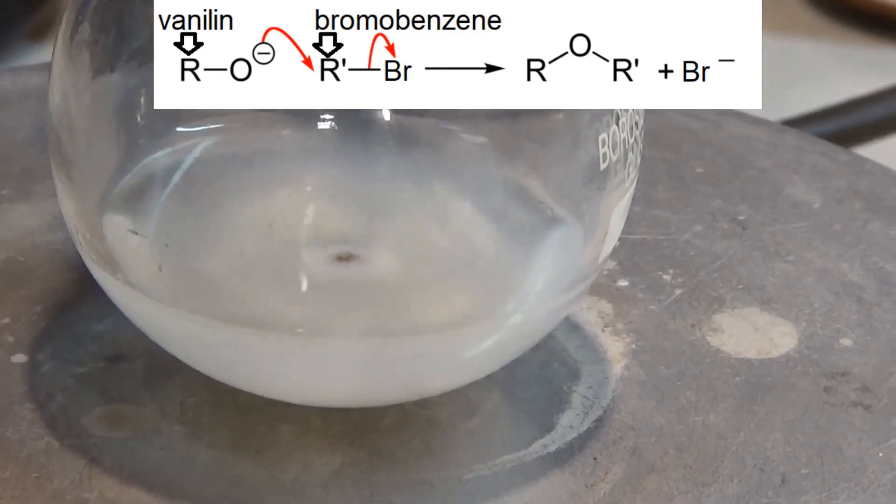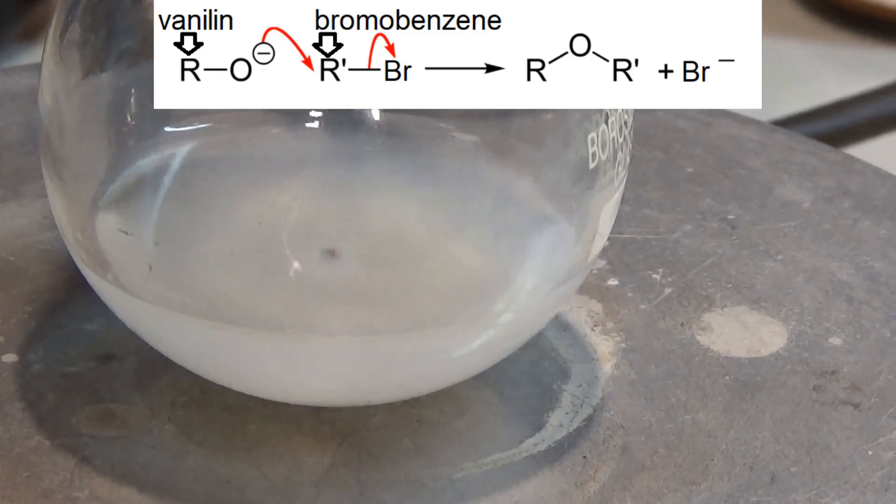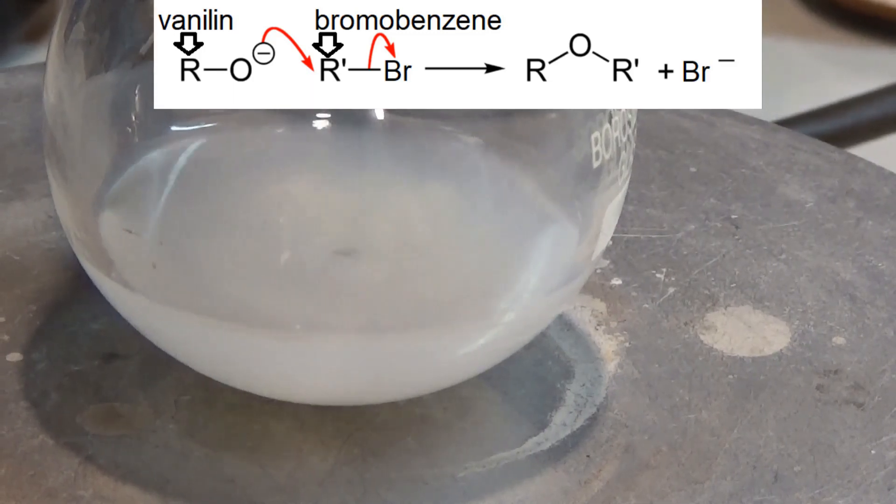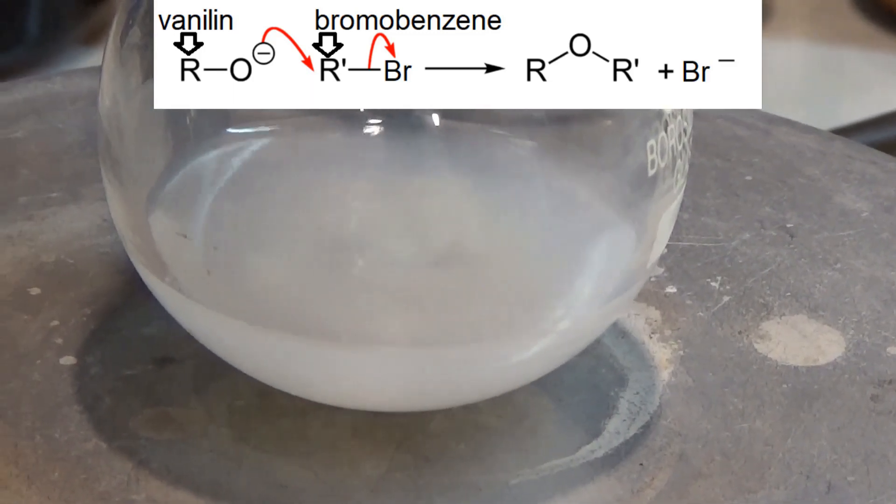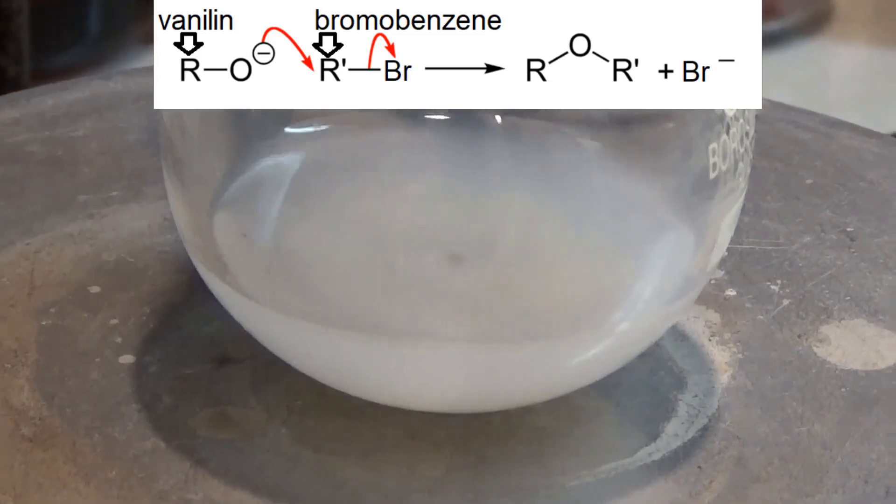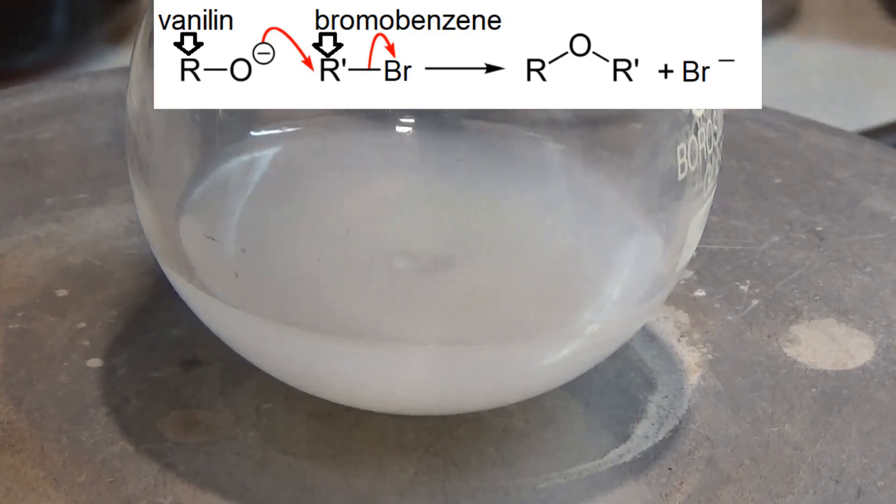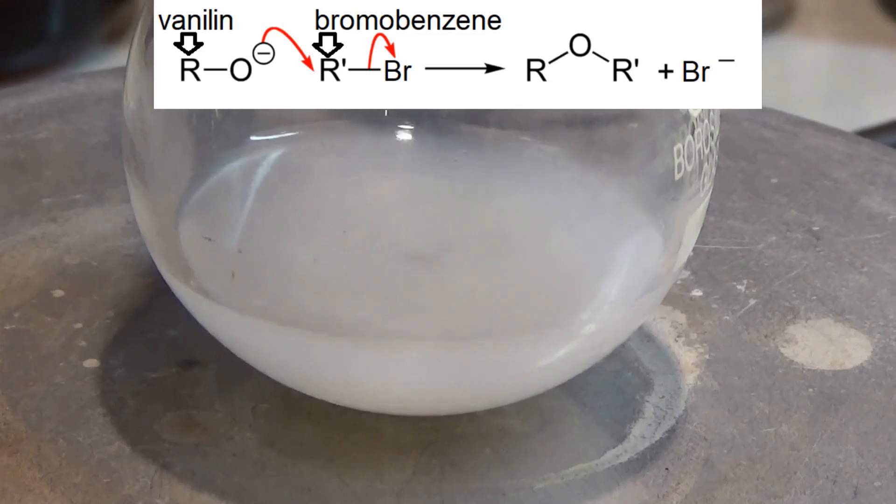This reaction type that we are performing is the so-called Williamson ether synthesis. It is a special type of nucleophilic substitution wherein alkoxide acts as a nucleophile. In our case the sodium hydroxide reacts with the OH group of the vanillin and yields the alkoxide ions in situ.